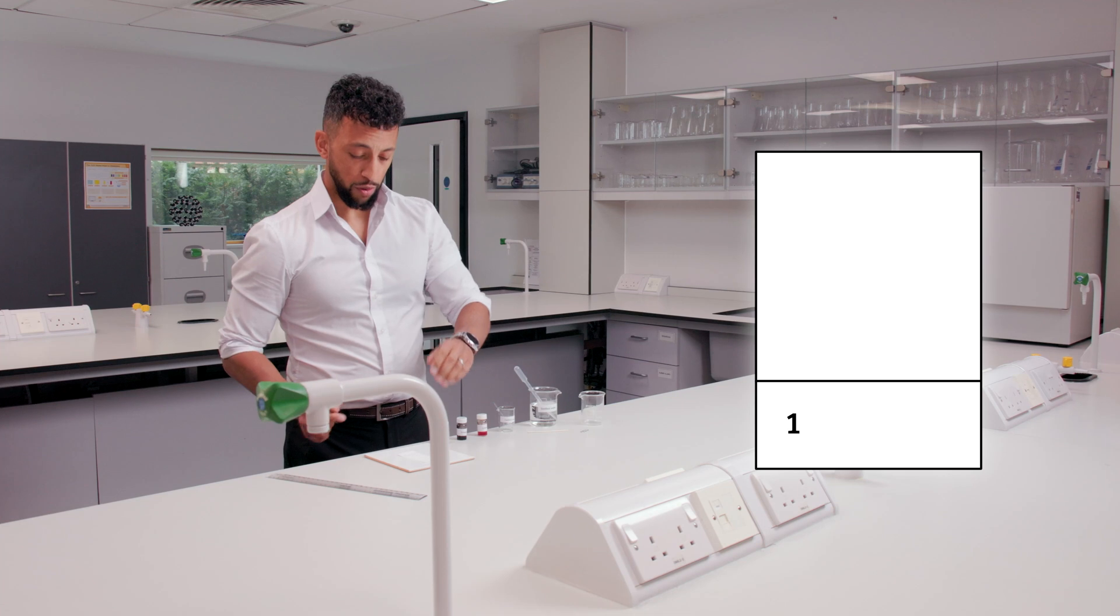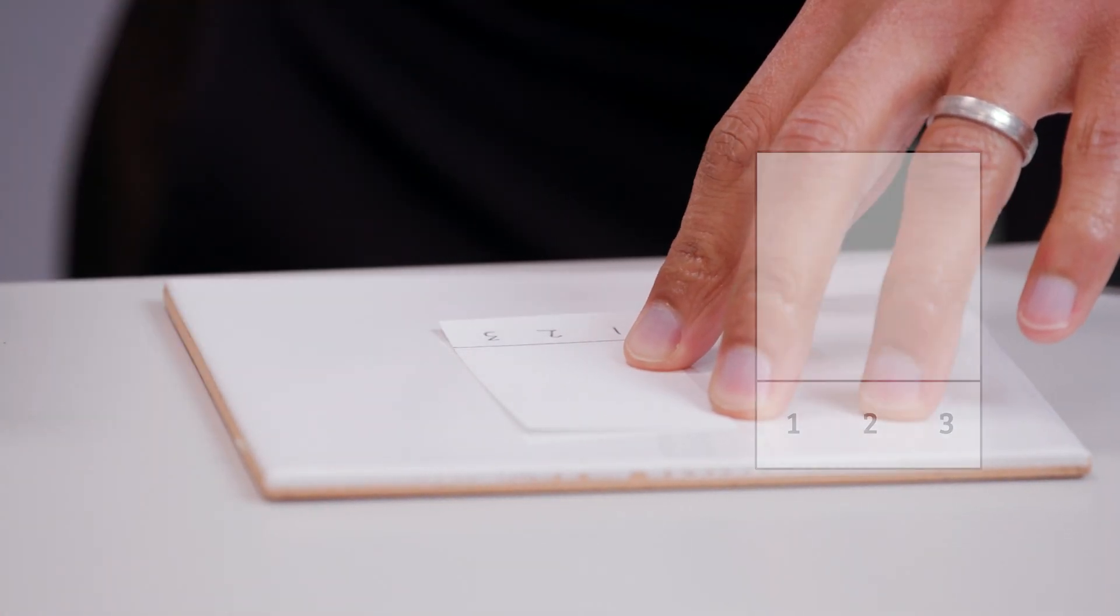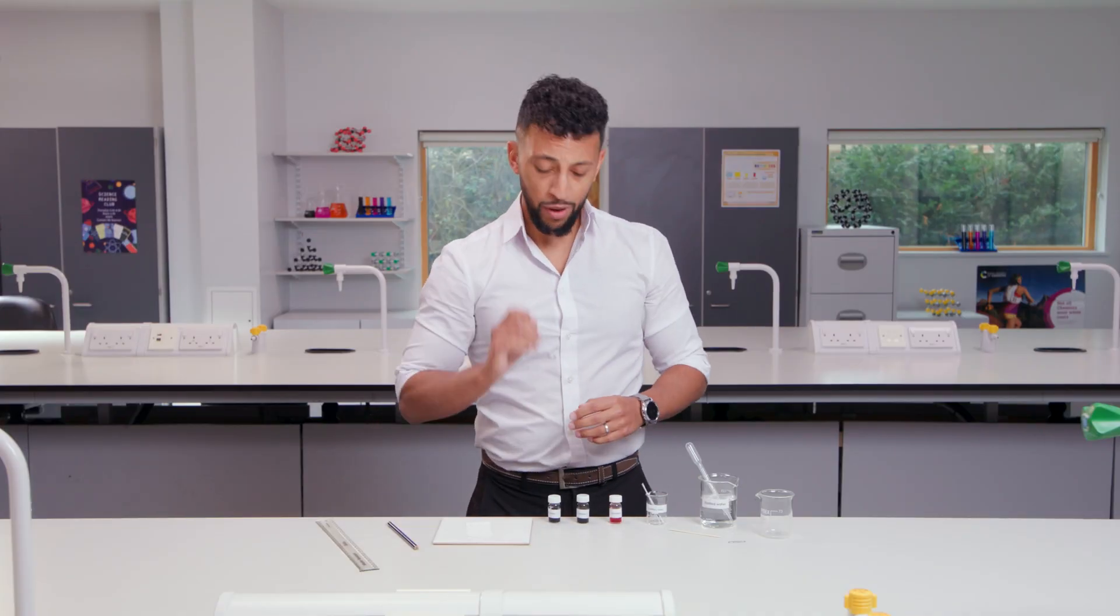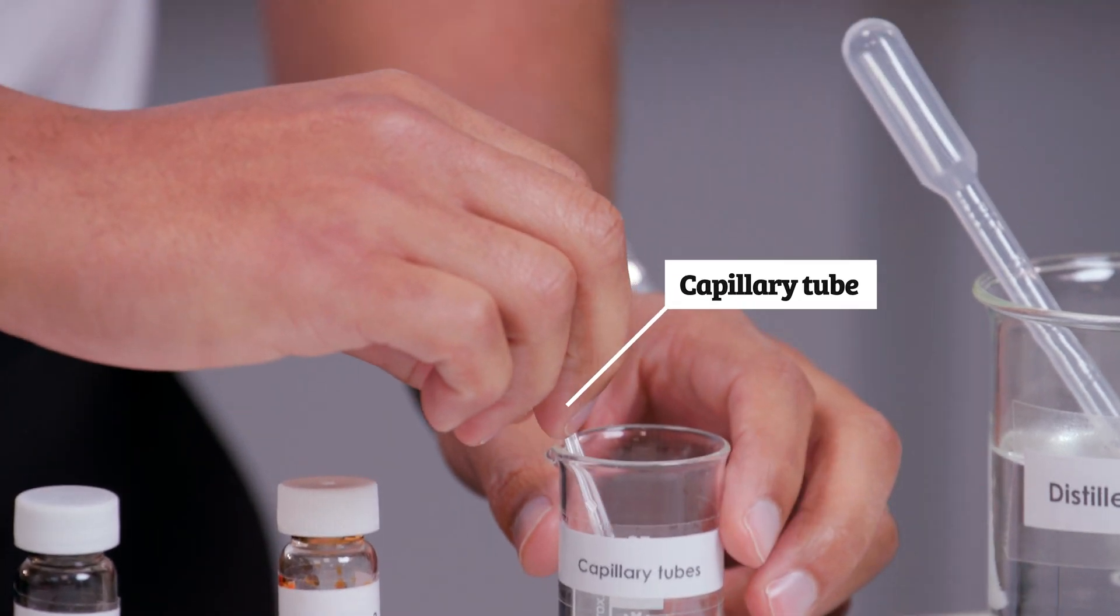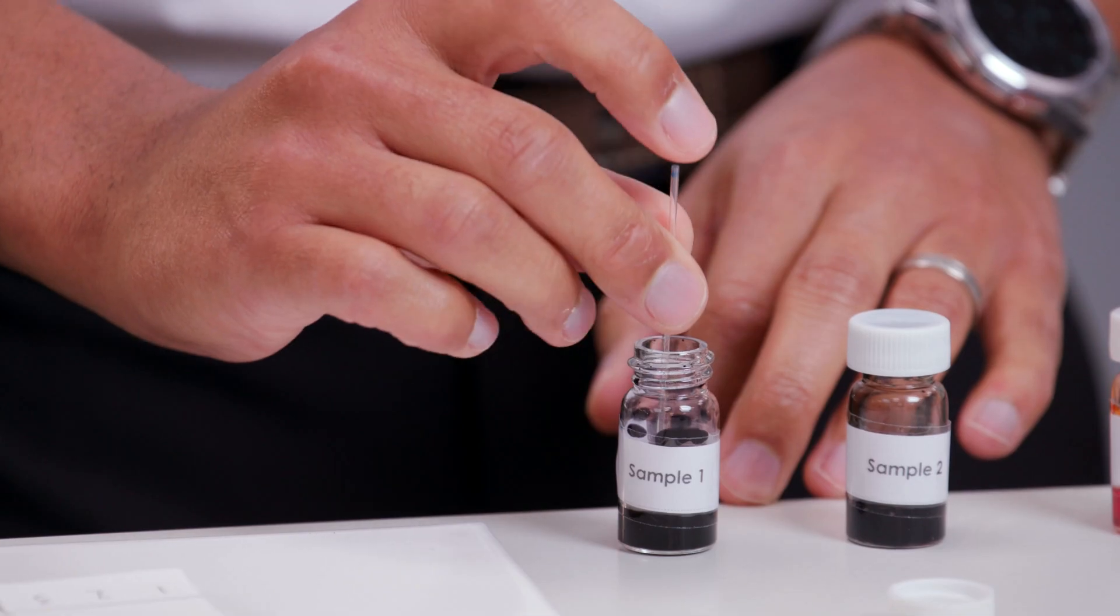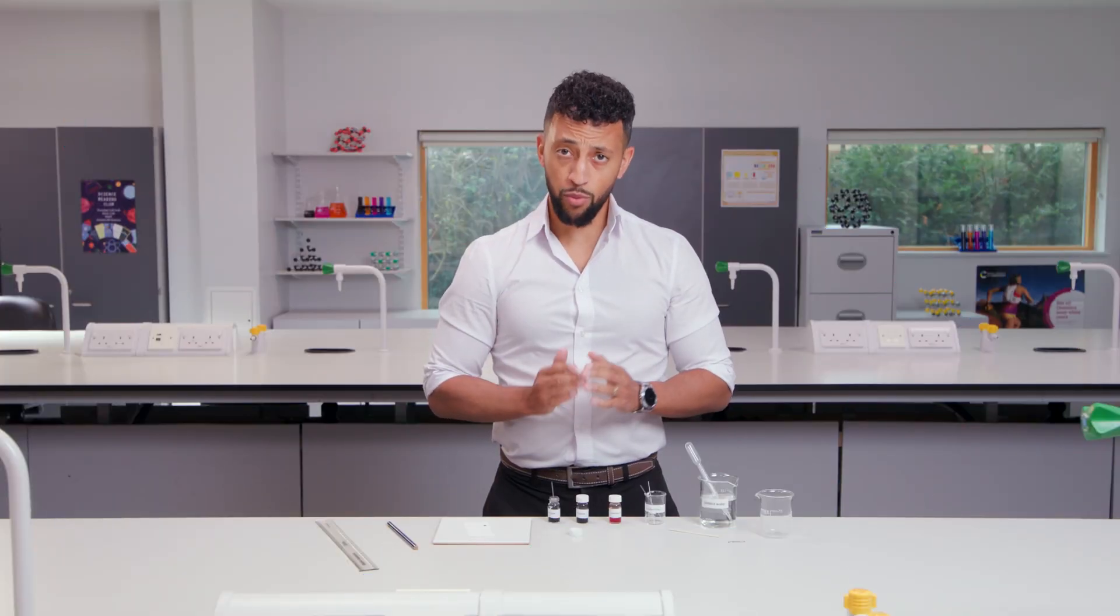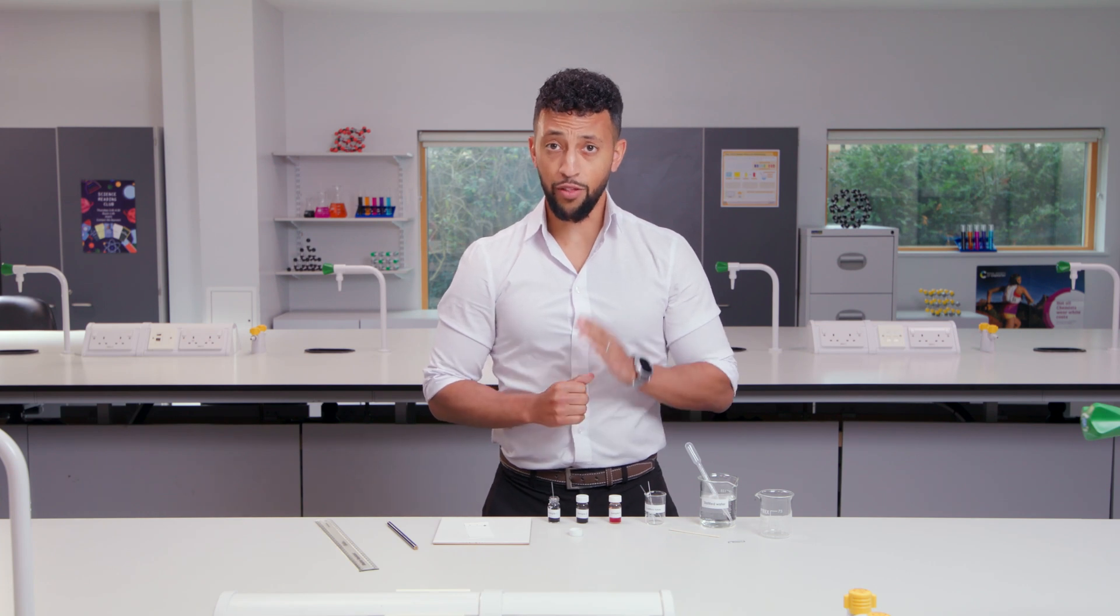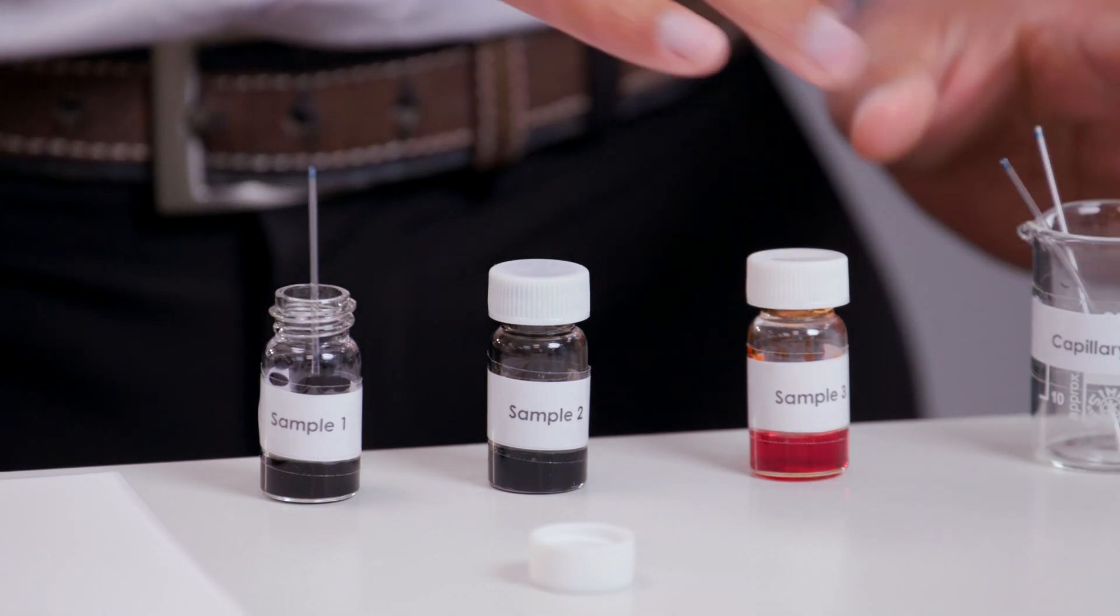Label the paper with samples one, two and three. I now need to add a small amount of my first sample by dipping a capillary tube into the ink just like this. My second sample is a different black ink and the third sample is an orange ink that I think is pure. I'm now going to add them.